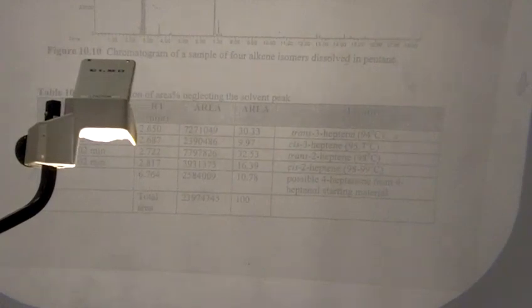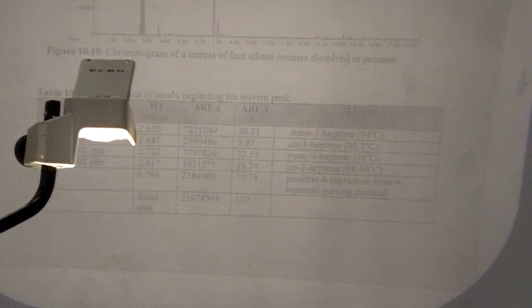The other thing to keep in mind, something that will come off in the GC but you don't have a standard retention time for, is that your alcohol can actually oxidize to form a ketone, okay? That ketone comes off at a very slightly lower boiling point than your alcohol. So it's going to come out at a faster retention time than your alcohol, right before your alcohol.